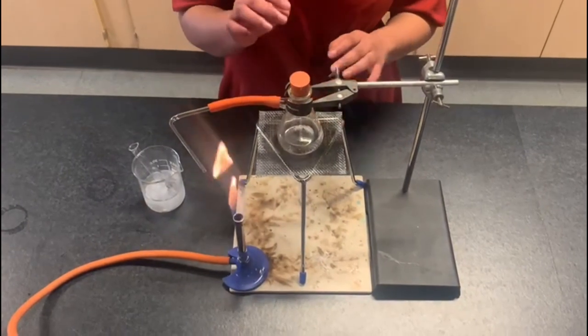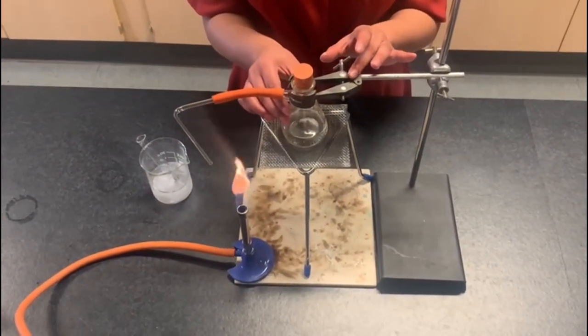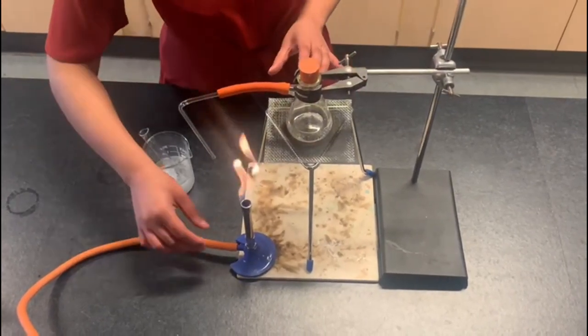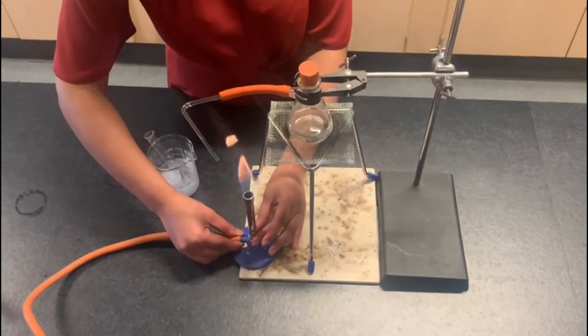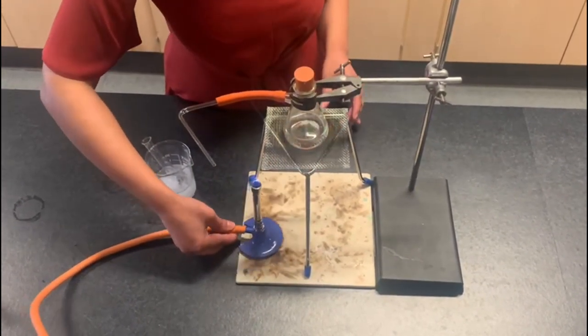We've just placed the bung on top of the conical flask and secured the neck of the conical flask with a clamp just so it does not move. We will then change the flame to the roaring flame and place it underneath the conical flask.